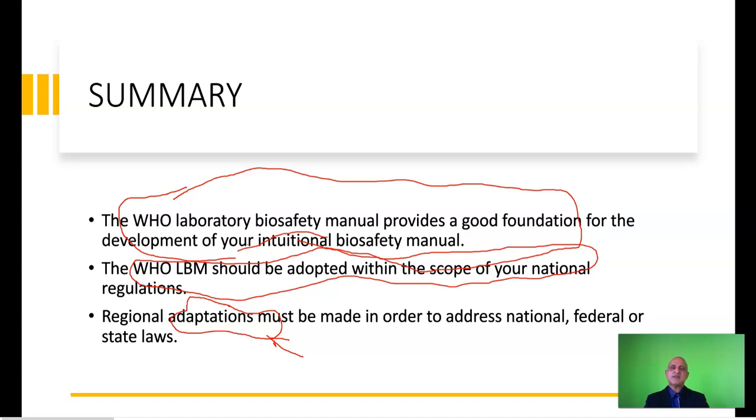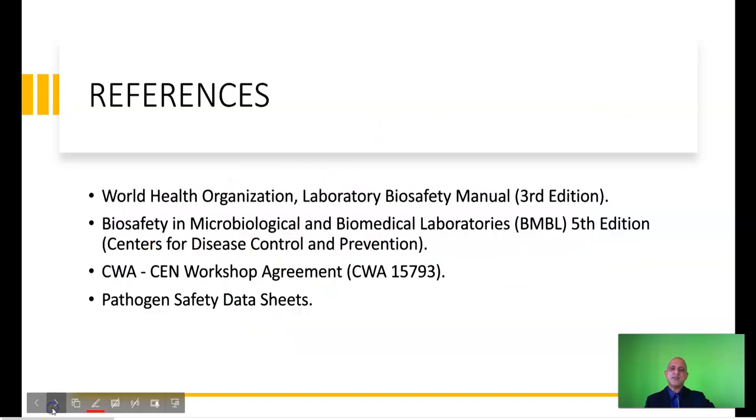Which brings us back to the key point, which is that biosafety and biosecurity are both collective responsibilities of individual laboratories as well as member states of the WHO. Please ensure that your laboratory is maintained according to the national and international requirements for biosafety.